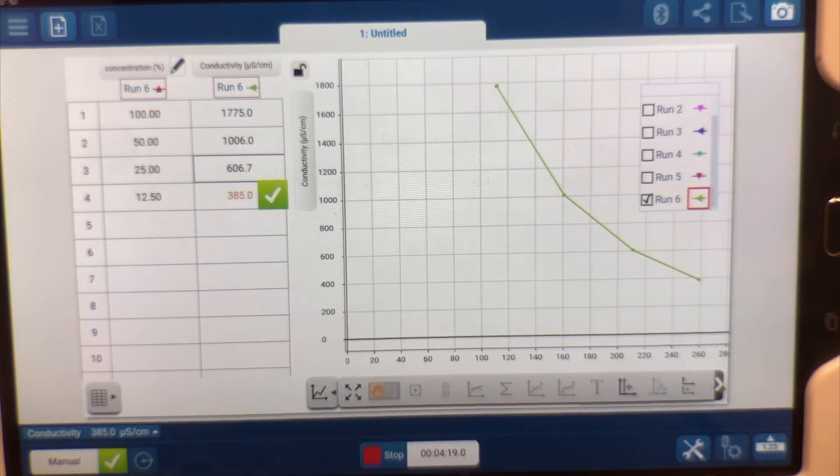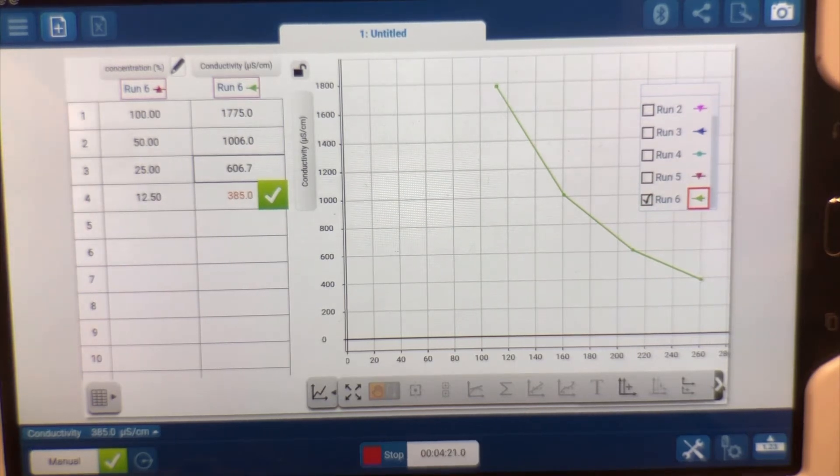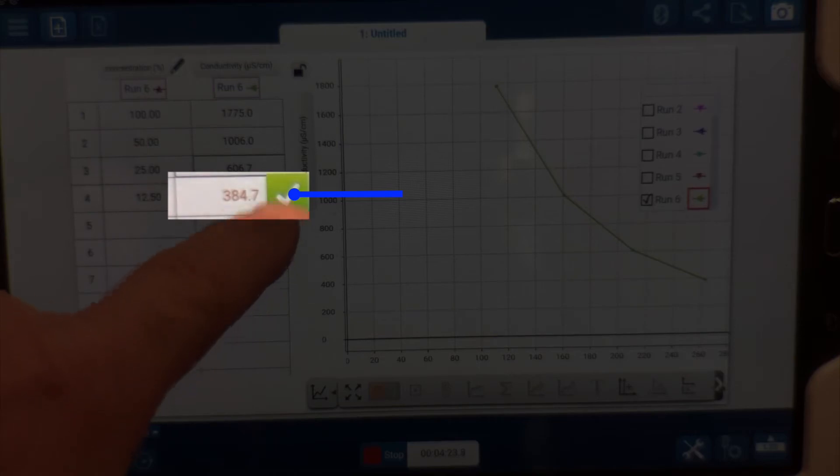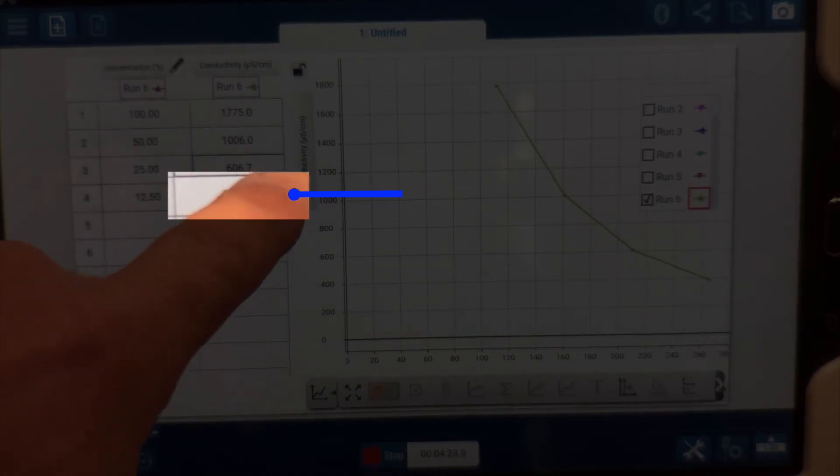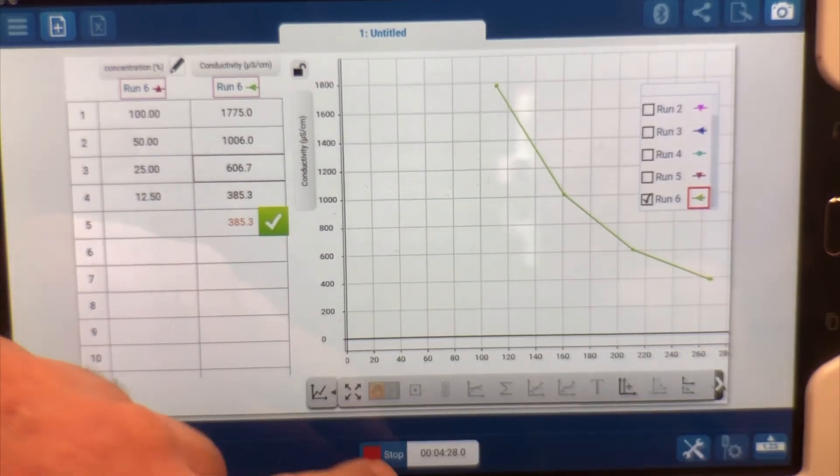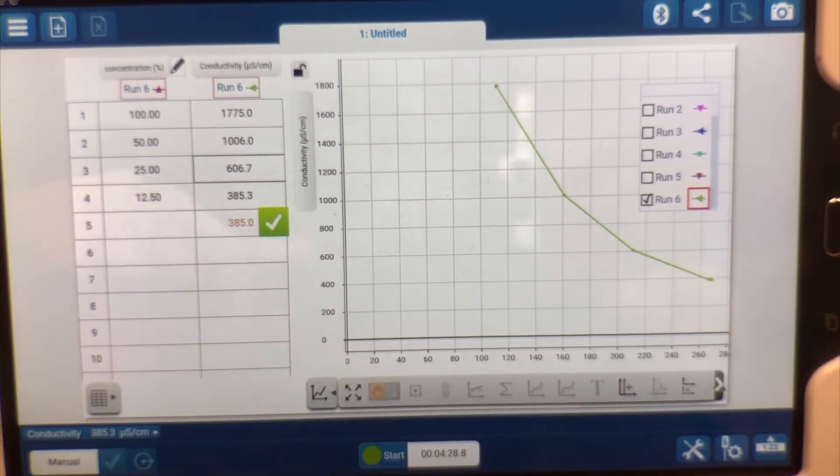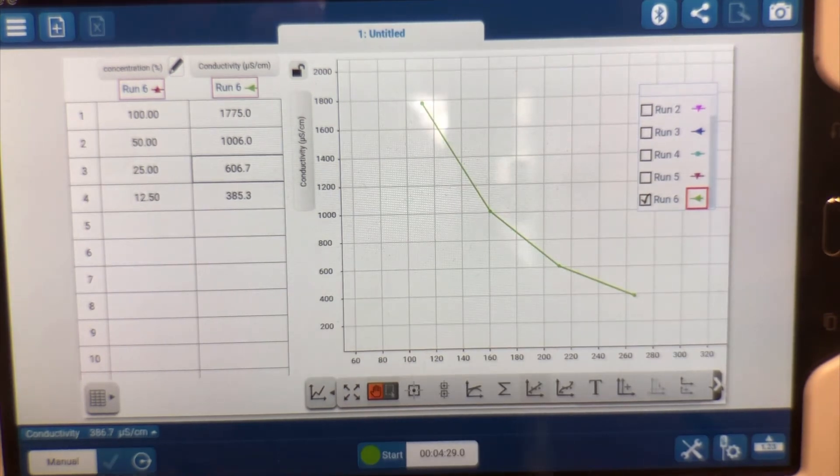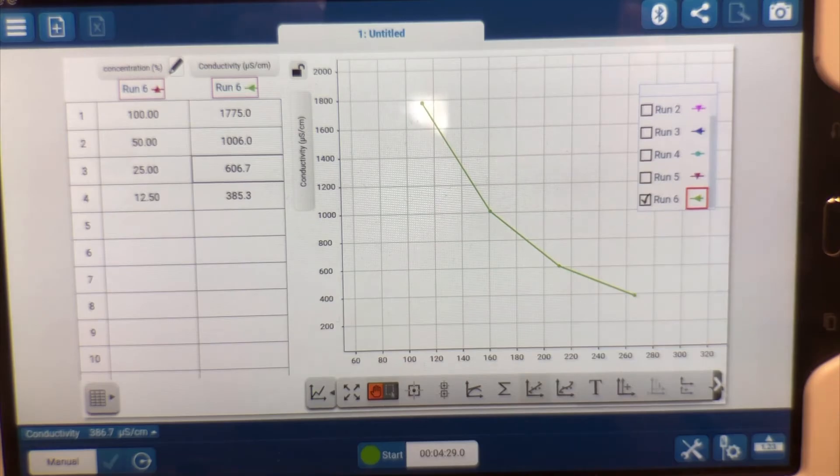Now that it's hovering right around 384, I'm going to go ahead and click it one last time. And this is where I'll stop. So this is our lab on how concentration affects conductivity.